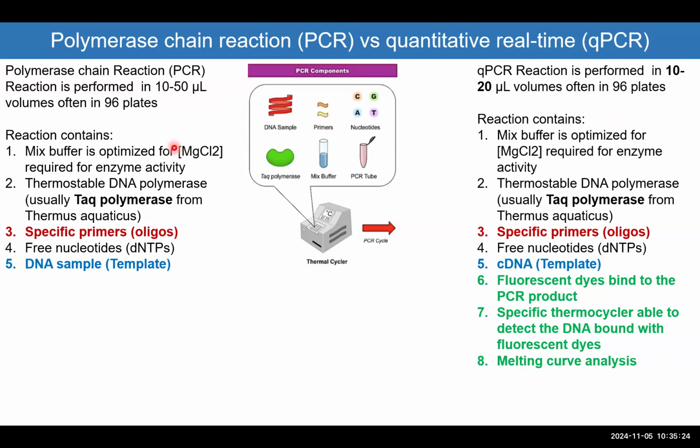take place. And the optimal buffer has to have the best situation for an enzyme to be active, which is the Taq polymerase in this condition, because it's the enzyme that is polymerizing the gene amplification. We need to generate specific primers, and now you know how to generate primers based on the experimental setup, as you saw in the assignment 2.